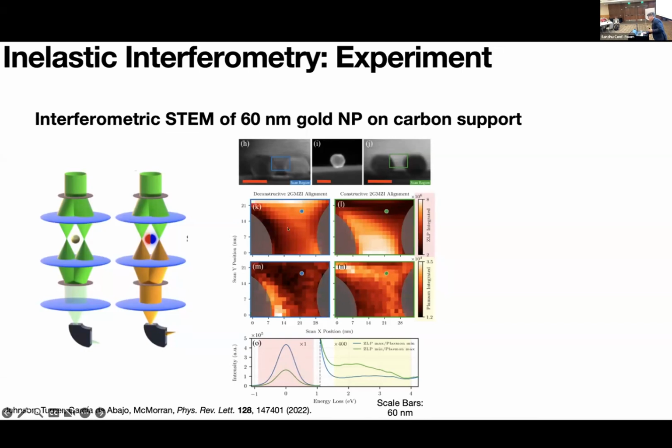Now here's the output of that interferometer. So we can see that there's a phase. There's an electrostatic phase that's introduced to one electron over another. We use that relative phase shift to form an image. Here, we tune our interferometer to the dark, so it's on a dark fringe, and we see that we can start to see counts in there. Again, if we're just introducing a relative phase.